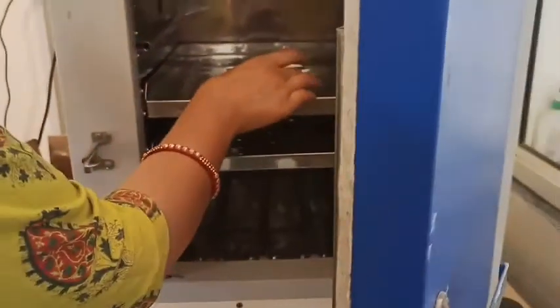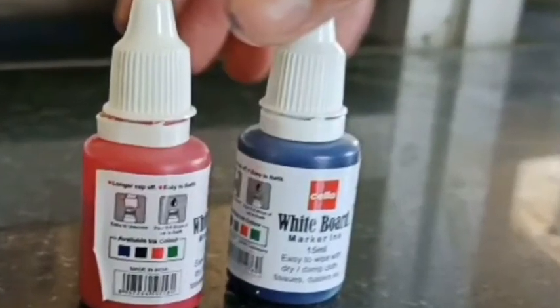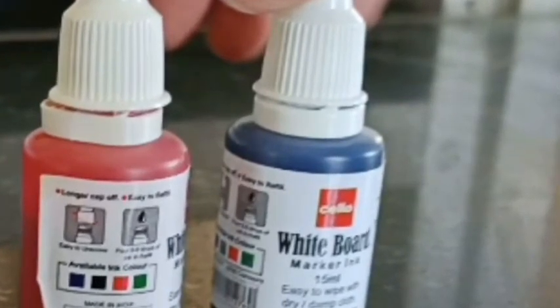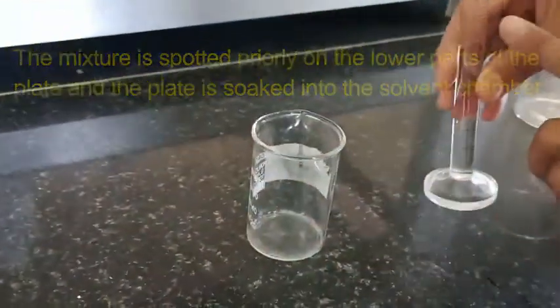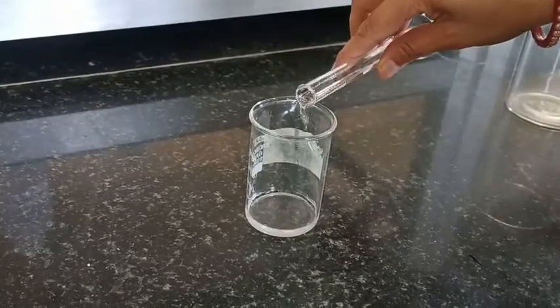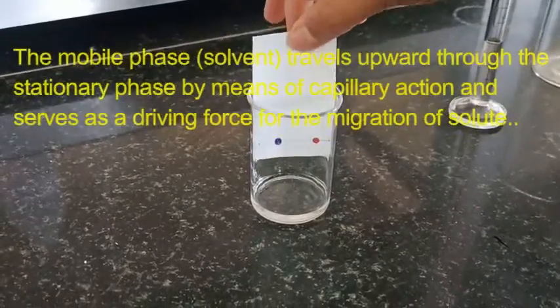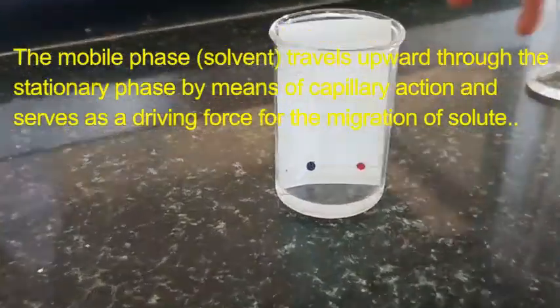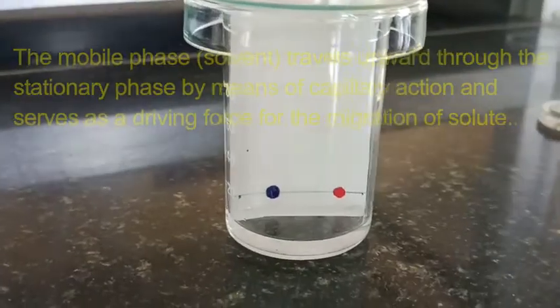Here we have the alumina sheet, Whatman filter paper, and the TLC plate which we prepared — I am taking it out from the oven now. We are going to load the solute — the solute is red and blue marker ink. On the paper I have loaded the sample. The solvent is methanol to chloroform in a 9 to 1 ratio. Now I am going to dip this filter paper in the solvent chamber, also known as the developing chamber. The solvent should be below the origin line.